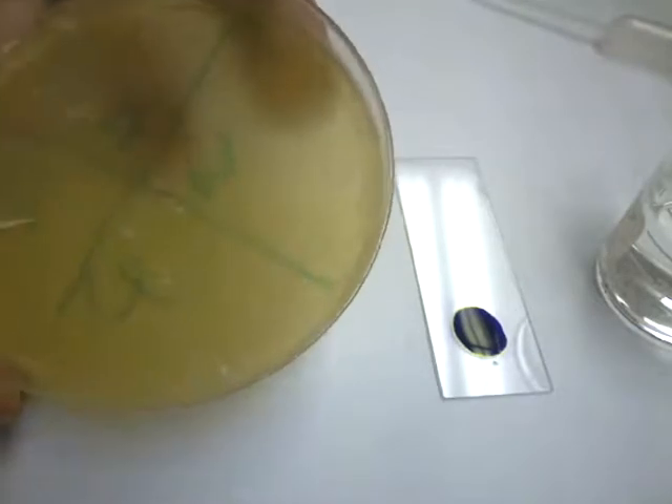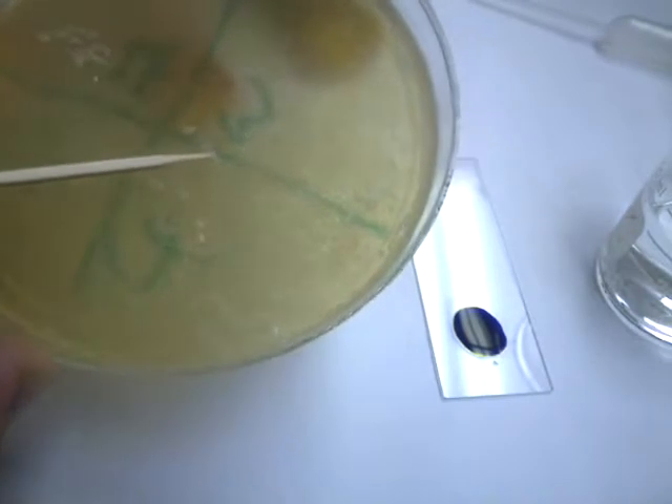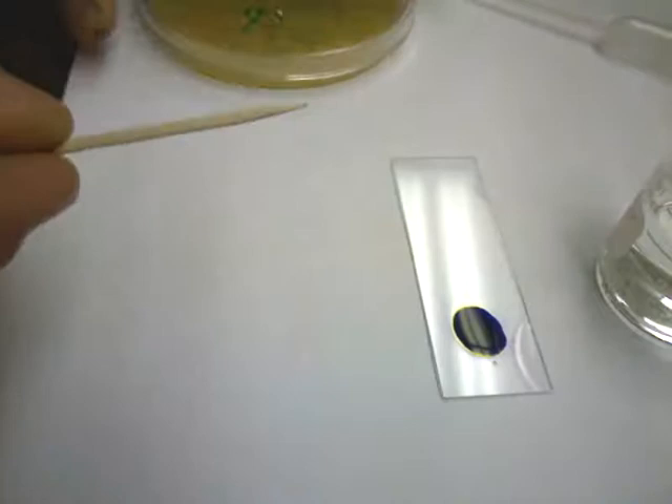With your toothpick, you'll find a colony that you like the looks of — one you'd like a closer look at — and just very gently rub the end of your toothpick in. You don't need a big glob. Just by touching the toothpick in there, you're going to get plenty of cells. Cover your plate back up and move it aside.